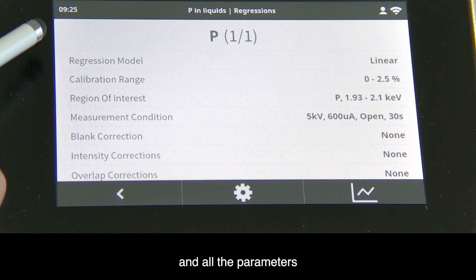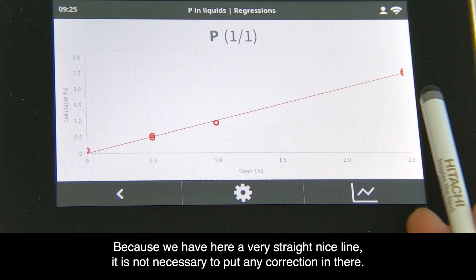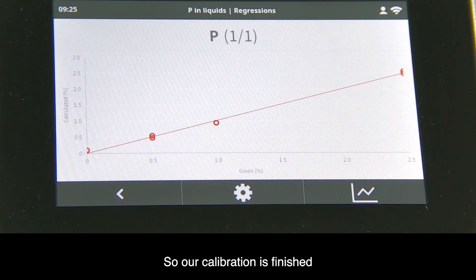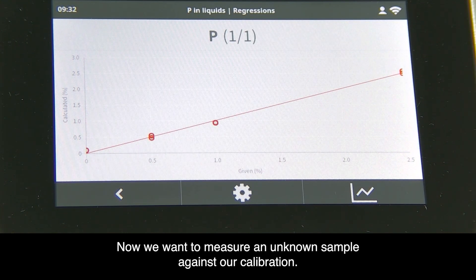You can see all the parameters. Because we have a very straight, nice line, it's not necessary to put any correction in there. Our calibration is finished and we're ready to use it for routine measurements. Now we want to measure an unknown sample against our calibration.